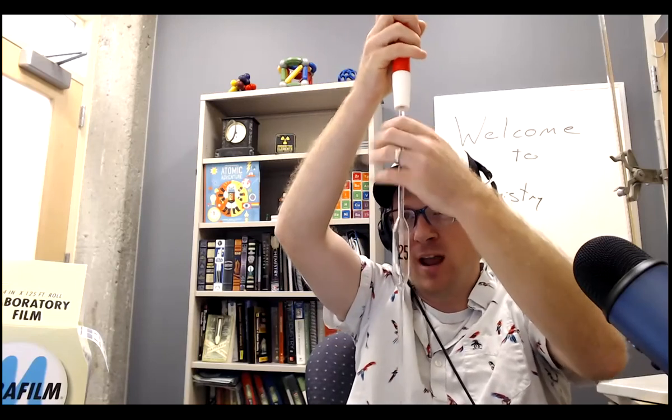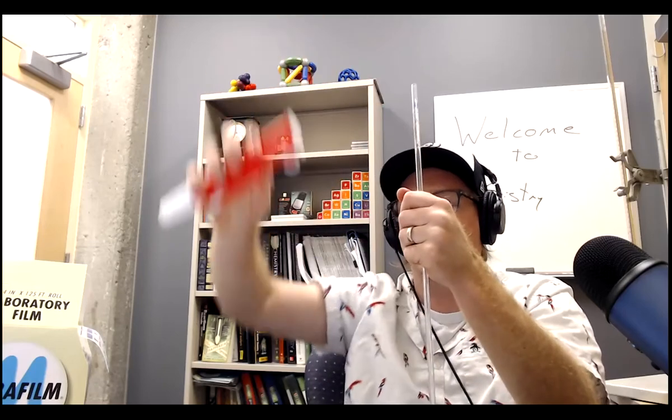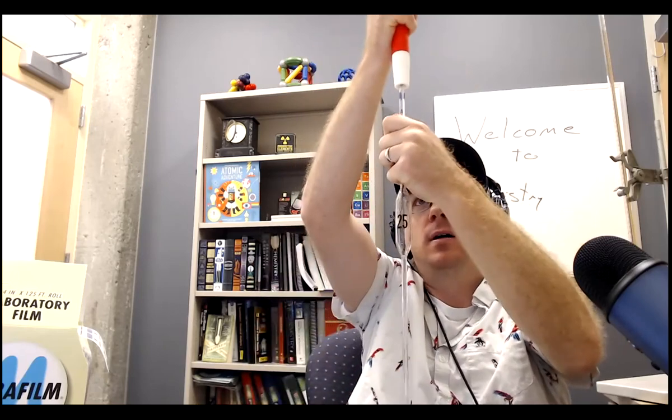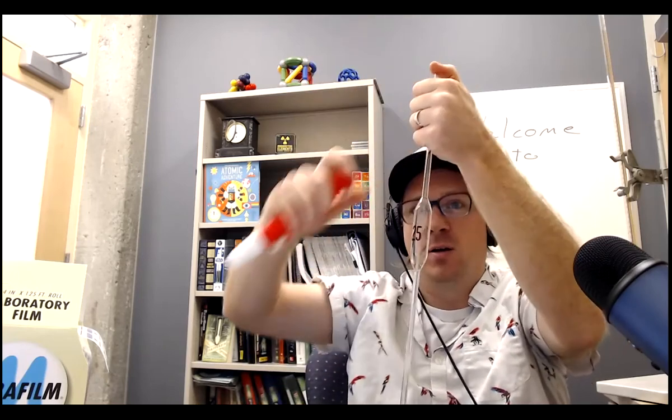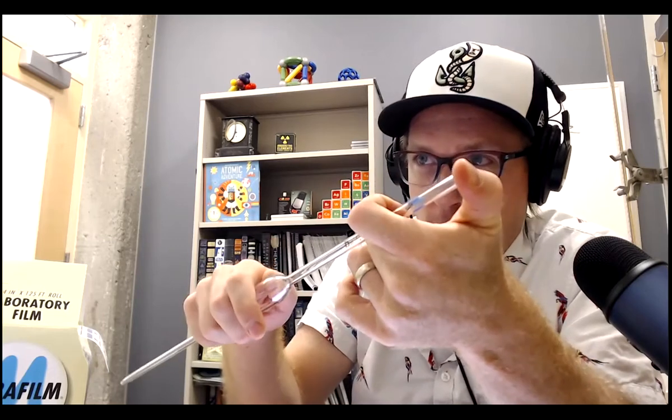And this is why it's important to have your hand near the top. Because if you're down here and you pull it off and set it down, get your finger up there, it's drained below the line. So have it near the top, pull it off, put your thumb over. It's a little bit above the line. This next part, it takes a little bit of practice. You might want to practice.